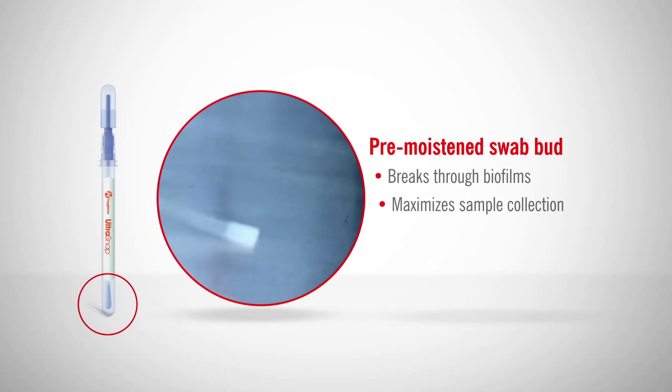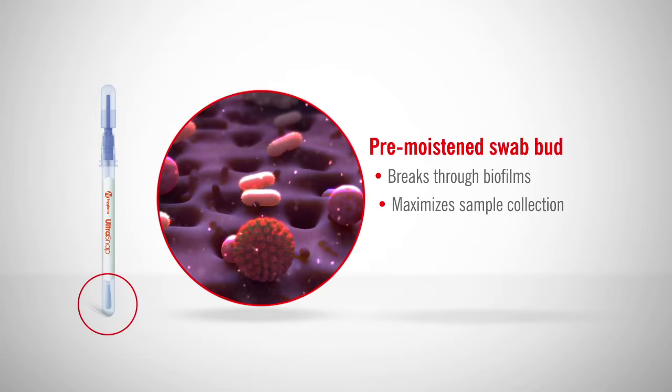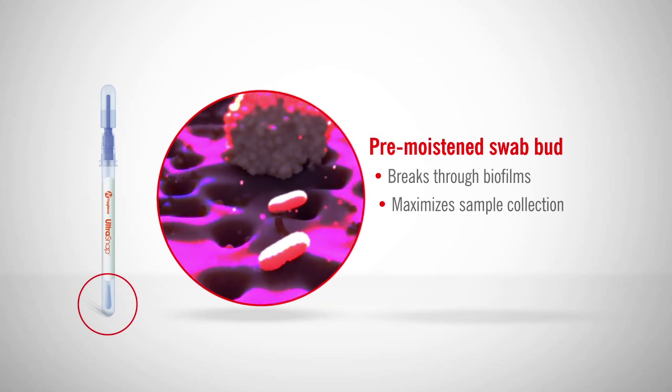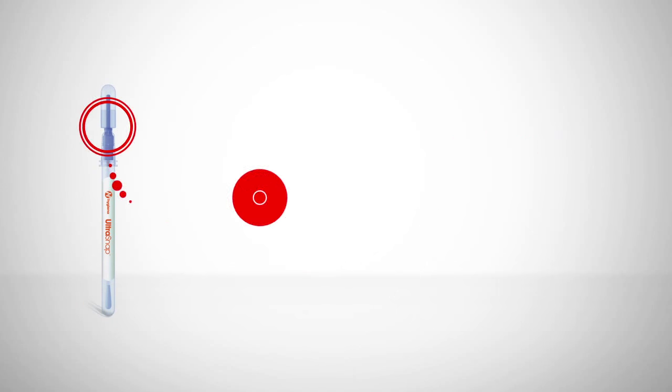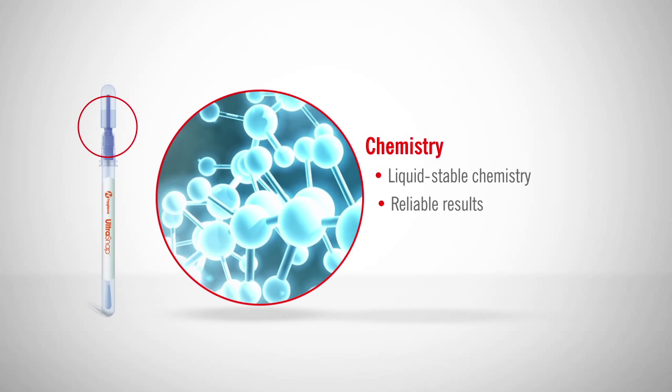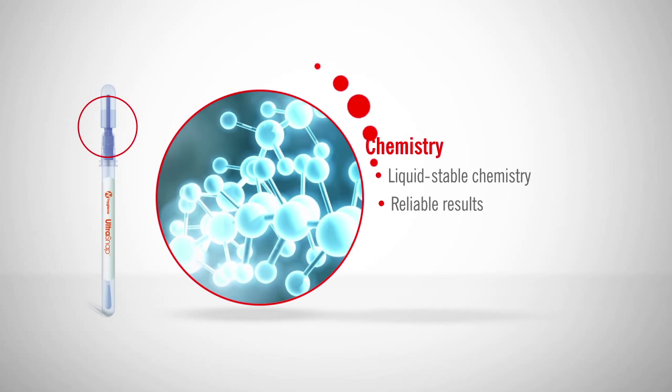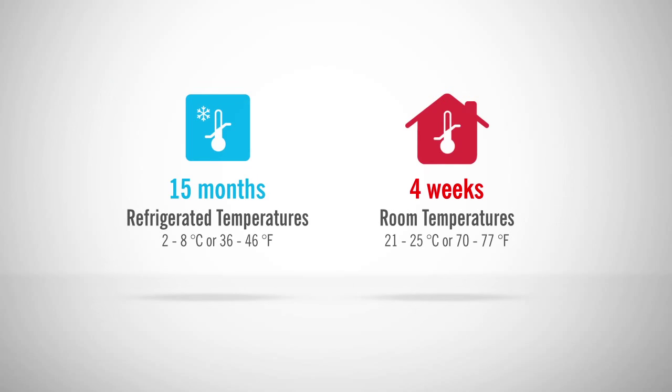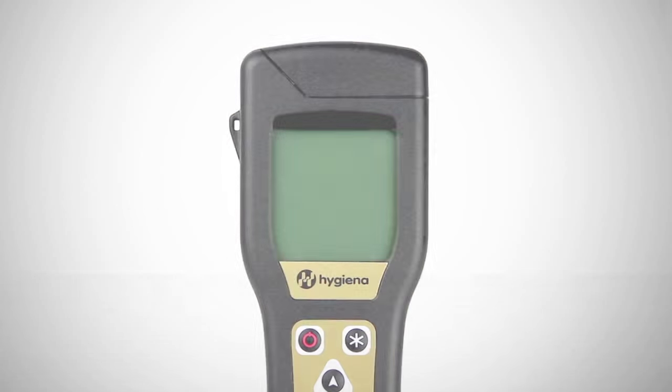UltraSnap's pre-moistened swab bud breaks through biofilms and ensures maximum sample collection for accurate results. The liquid-stable chemistry and Hygiena's patented SNAP valve facilitates superior sensitivity and reliable results. UltraSnap has a shelf life of 15 months at refrigerated temperatures and 4 weeks at room temperature. Now let's see how it works.